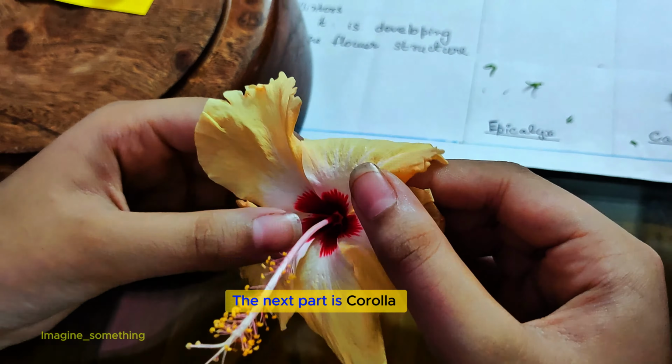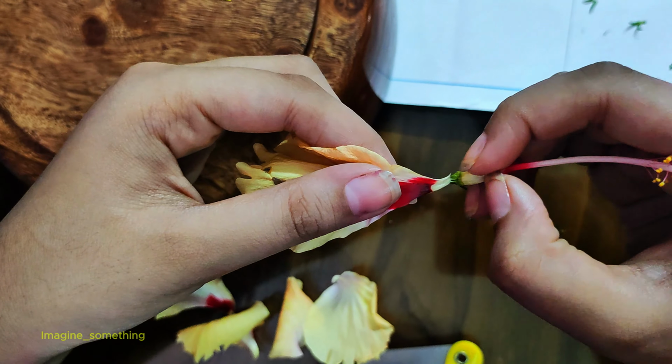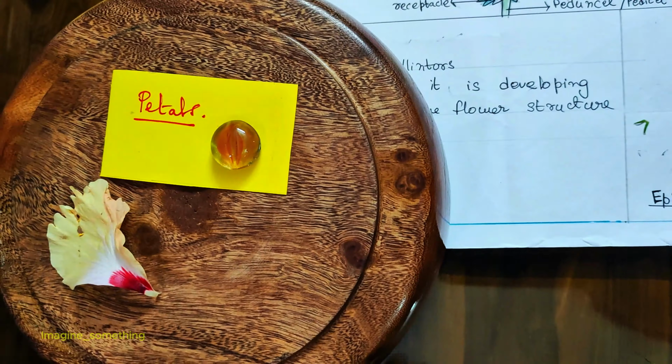The next part is corolla. It is the colorful, attractive part of the flower known as petals which attracts the insects. So we can see there are 4 to 5 petals. I want to take out these petals. We will just have to pull the petals aside so that we can see the ovary inside. The corolla encloses and protects the stamens and pistils.